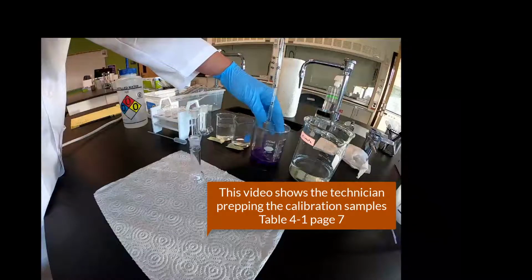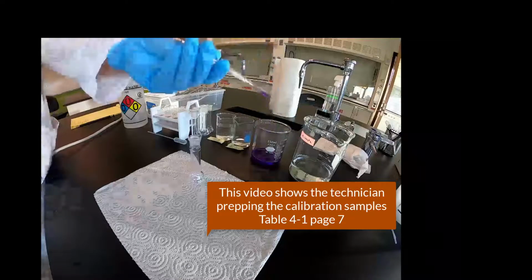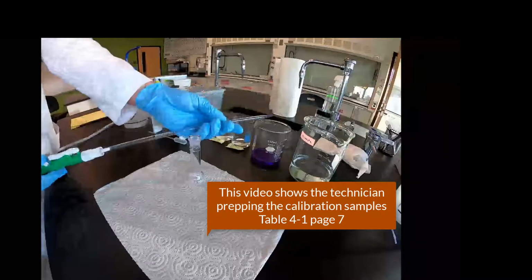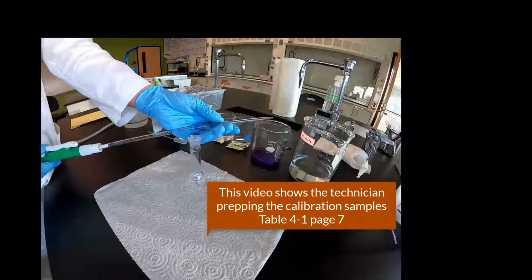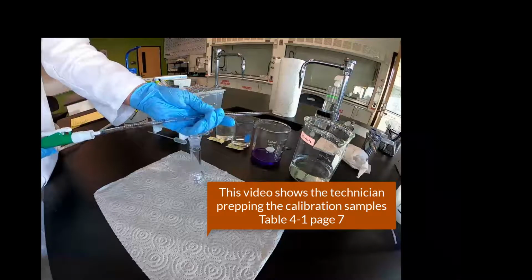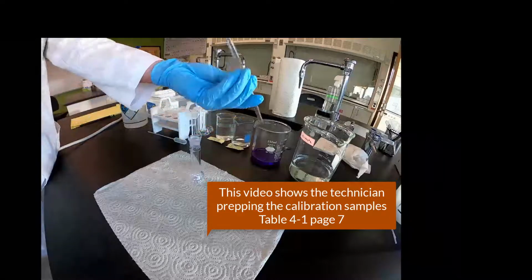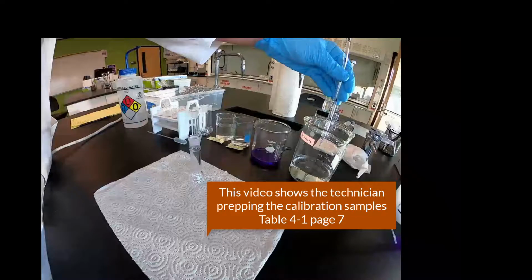He's going to rinse it out with a little bit of the mother solution. So draws up just a little bit, turns it sideways, draws it up into the chamber, the cylinder a little bit. Then you can see that whole band moving across there. So now you want to just dump that back into waste, not back into sample. Okay, over to waste. Good job.